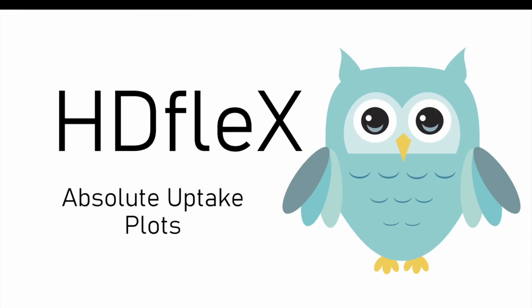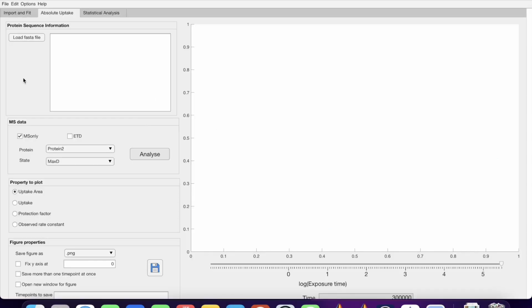In this video, I will show you how to construct absolute uptake plots for your HDX analysis. So after completing all the import and fitting of the data in the first tab, we can now move on to constructing the absolute uptake plots for each state of the protein.